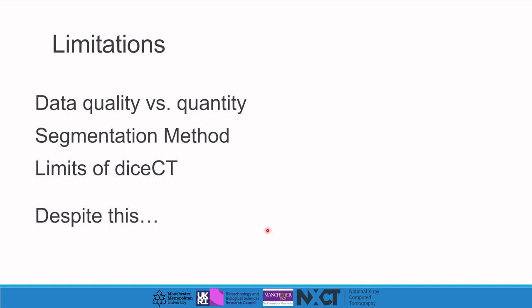Our data processing methods and chosen resolution managed to identify what we believe to be the larger scale muscle structures which control the whisker movement. However, as I touched on earlier, we may have failed to resolve finer features in the data. This is a limitation of any imaging technique, but it bears mentioning as we can only measure what we can detect.